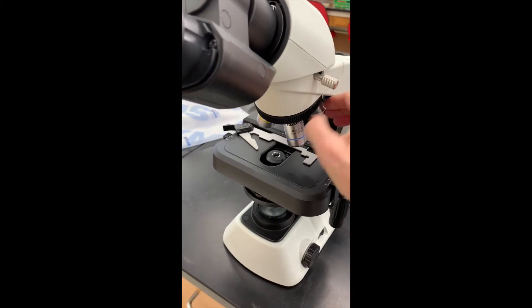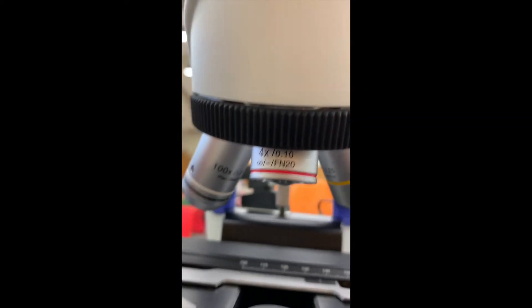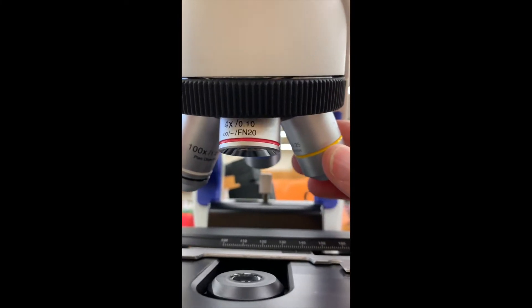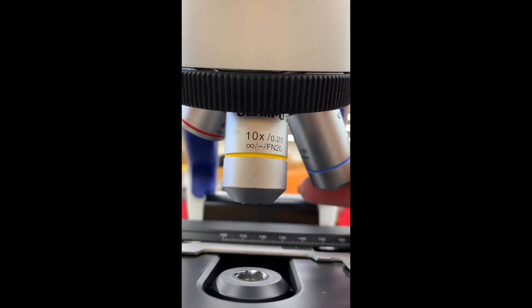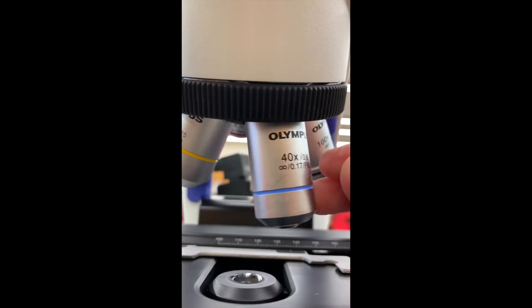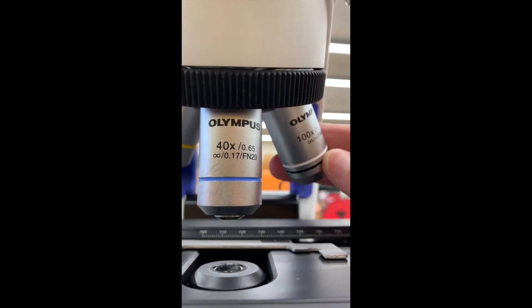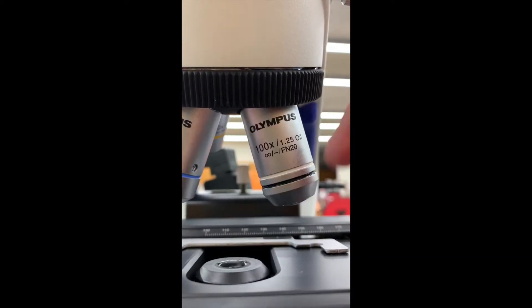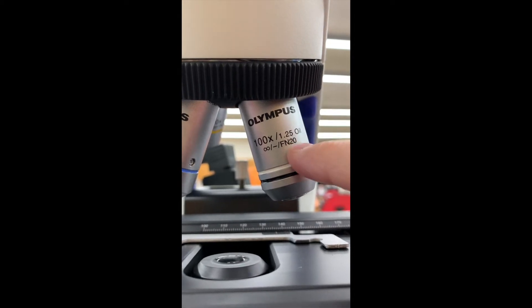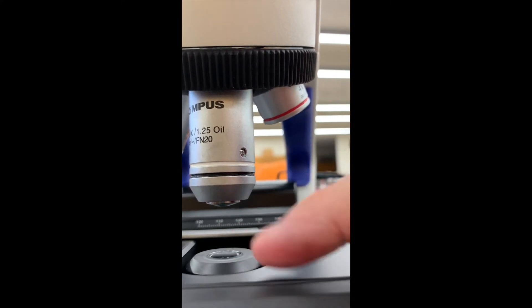We have four objectives. This is the 4x objective, so you're going to start with this, and then you move to 10x which is yellow. Then you will move to 40x which is blue. And finally, you'll put your drop of oil on your slide and then use the 100x oil and click that into place. It should be tight on the slide.